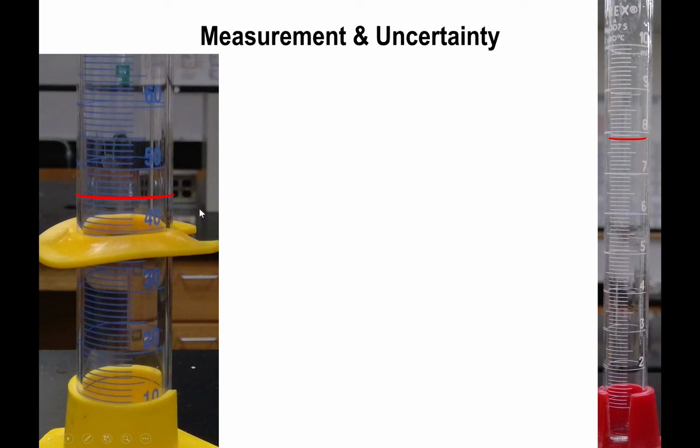All right, now in the laboratory, what you would normally be doing is making measurements, either of mass or volume. But I want to talk about the measurements of volume for a second. In particular, we have graduated cylinders, which are made to take up a certain volume. It could be a larger volume, like we have a 100 mL graduated cylinder here on the left side, and over here we have a smaller volume, 10 mLs.